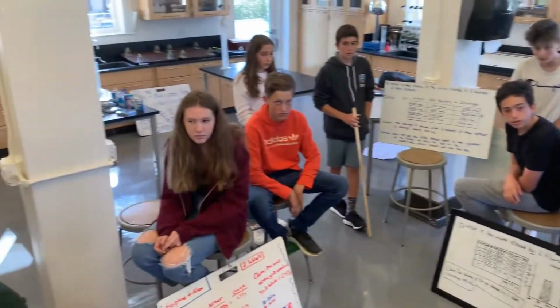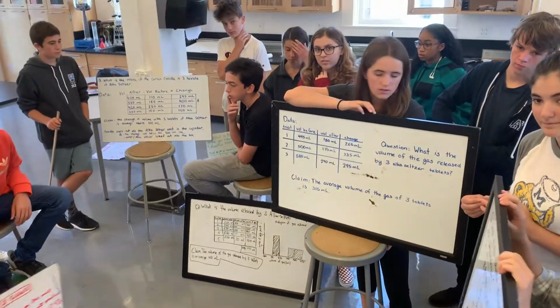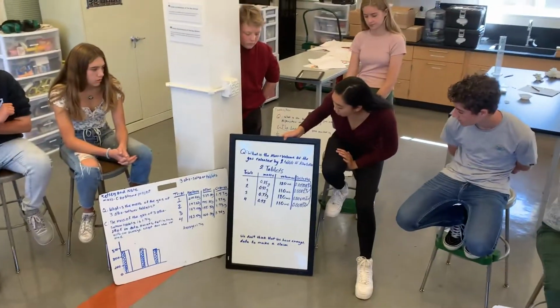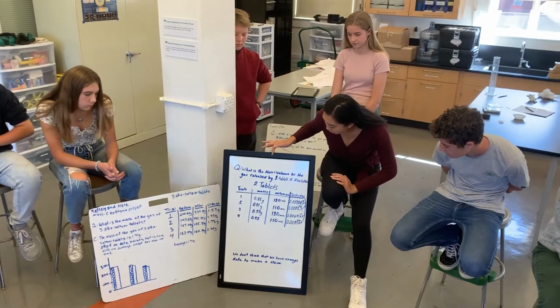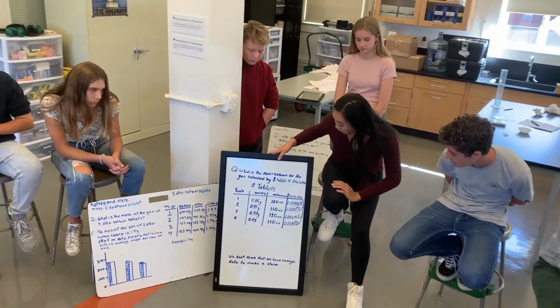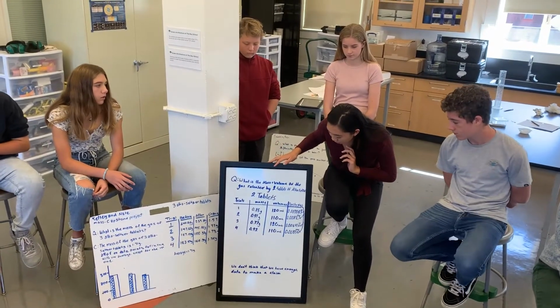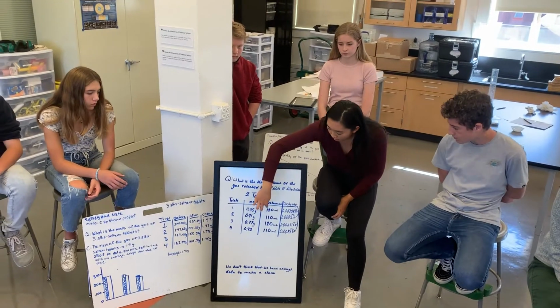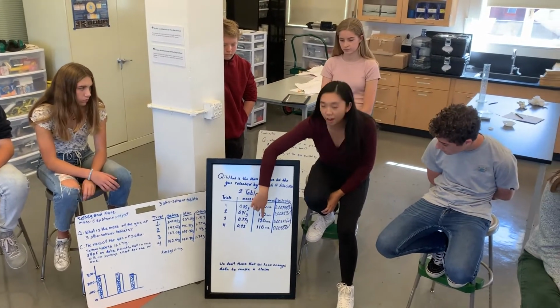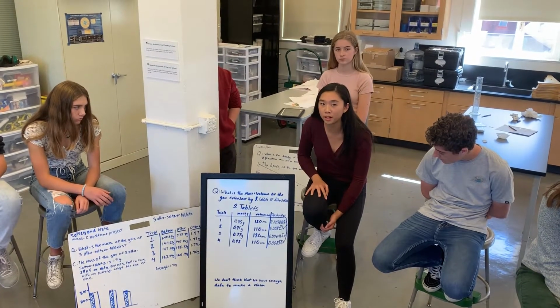Who's got 2? The volume of the gas. Who's got 2 Alka-Seltzer? Oh, we do. So we did 4 trials of the 2 tablets, and we didn't make a claim because I don't think we have enough data to make a claim, since it's kind of every other that type of thing. So I think we need more data to confirm which one it is.